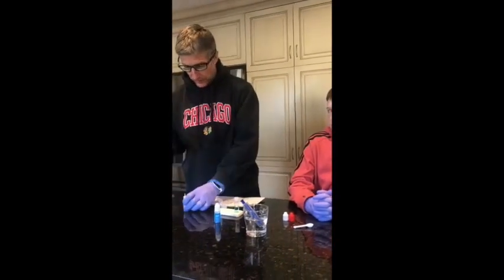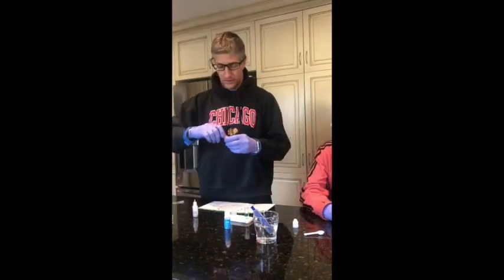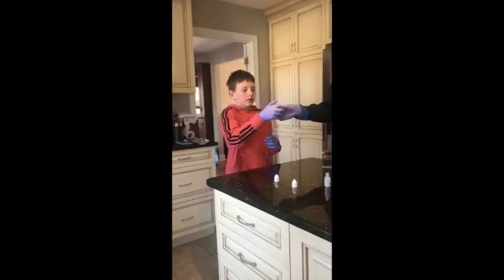Okay, so that's done, and the red cap is here. Duncan's going to put 20 seconds on the microwave timer for us, and he's going to shake that one up for us. Okay, press go and shake. Shake hard.